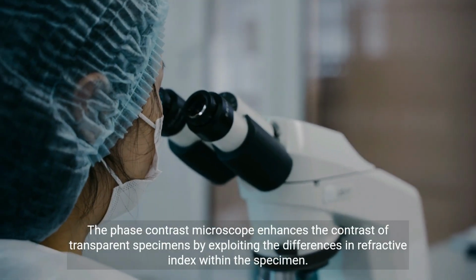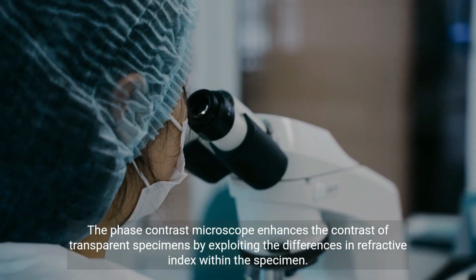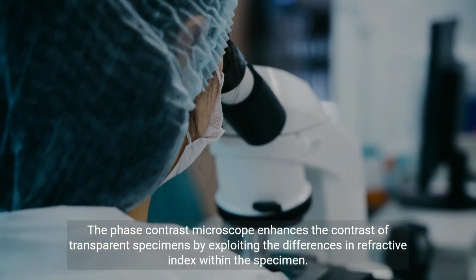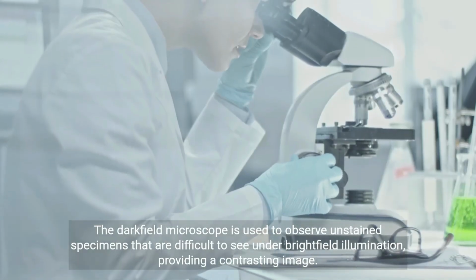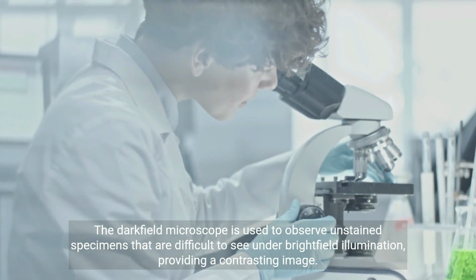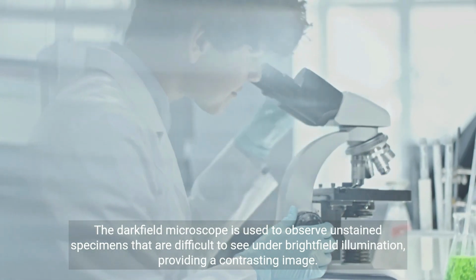The phase contrast microscope enhances the contrast of transparent specimens by exploiting the differences in refractive index within the specimen. The dark field microscope is used to observe unstained specimens that are difficult to see under bright field illumination, providing a contrasting image.